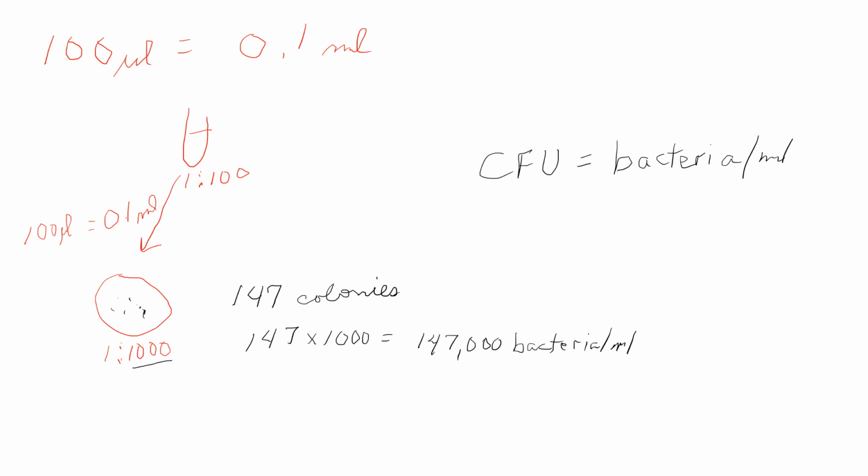It is from the set that you counted on those plates that was inoculated with the dilutions from page 1. So you have to go in order on these pages. You can't skip around, okay? Because you need page 1 to do page 2. You need page 2 to do page 3. Okay, so that should get you through the top of page 3.